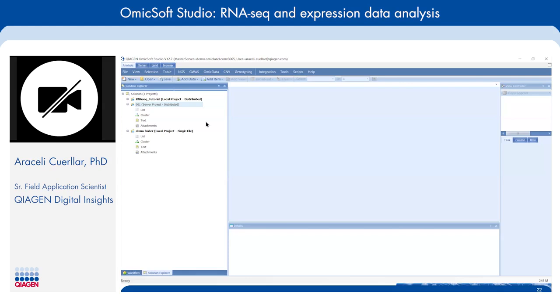All right. With this, let's go ahead and look at how we can analyze our RNA-Seq data. To start the RNA-Seq analysis from FASTQ files, you can use a ready-to-use pipeline that allows you to perform the analysis in one step, or you can do things step by step.